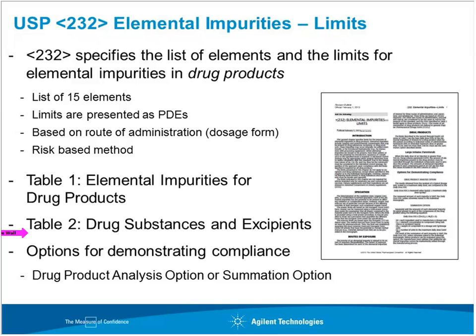So the chapter also outlines options for demonstrating compliance. There's the drug product analysis option and also the summation option as well.